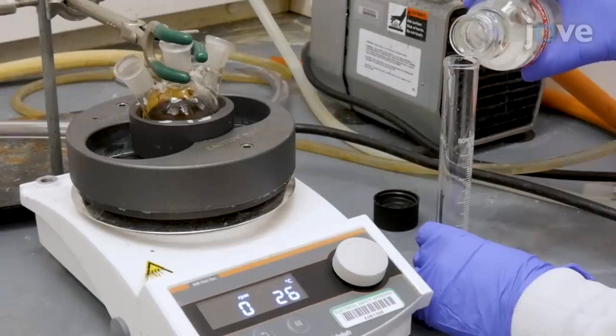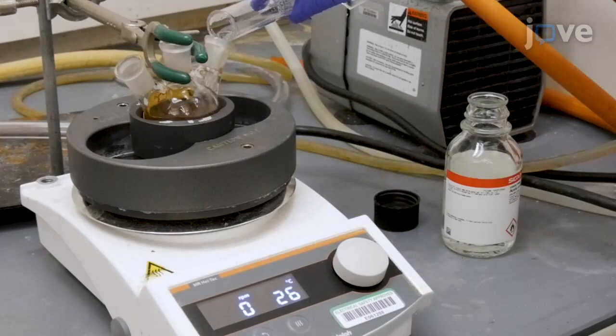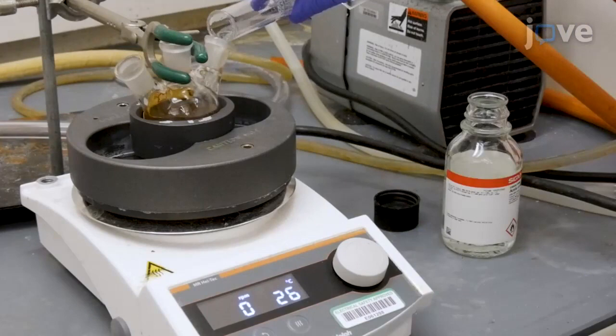First, add 40 mL of glacial acetic acid to a 50 mL three-neck round-bottom flask containing 0.75 g of palladium acetate and a stir bar.